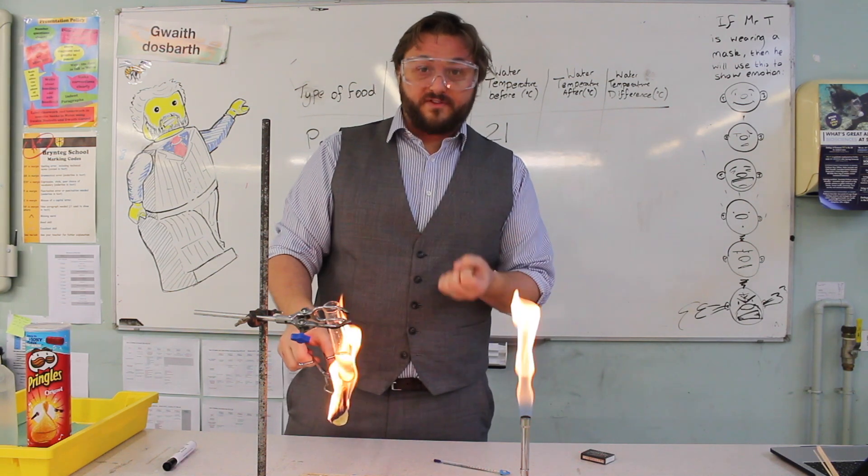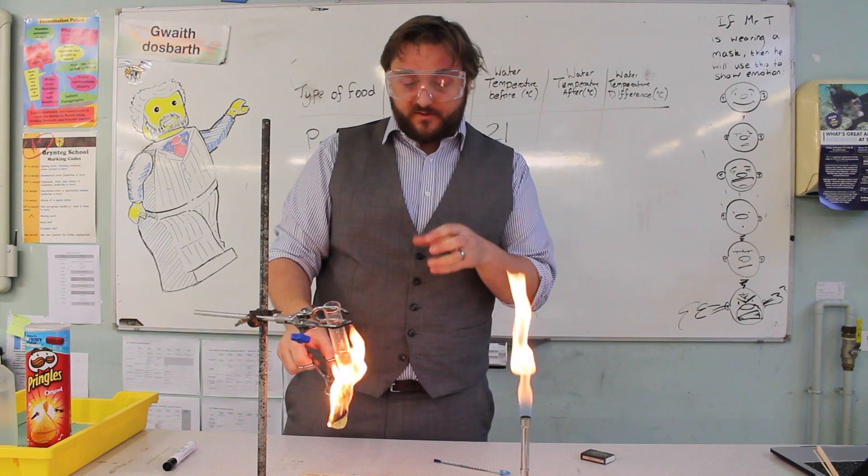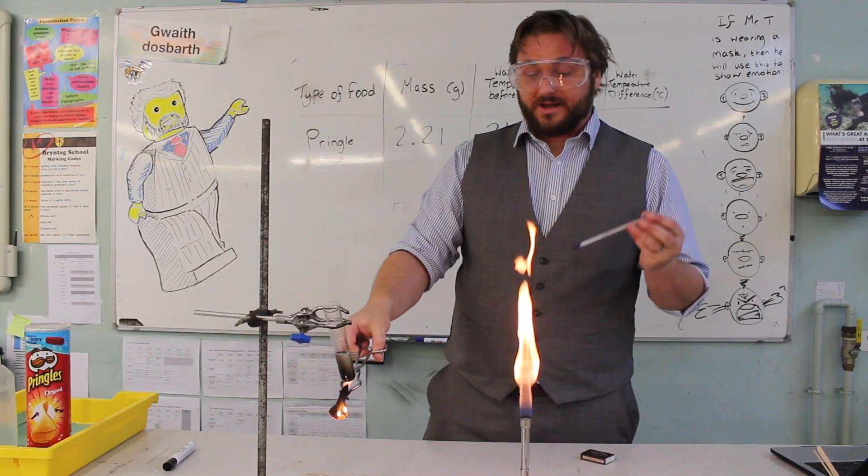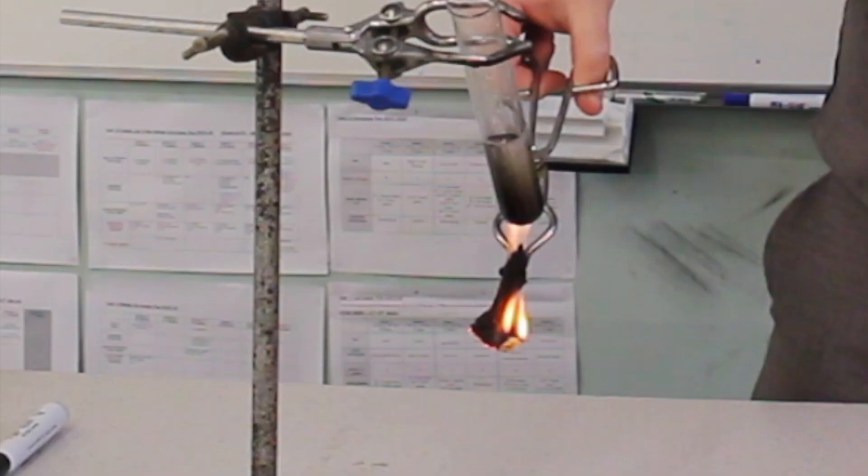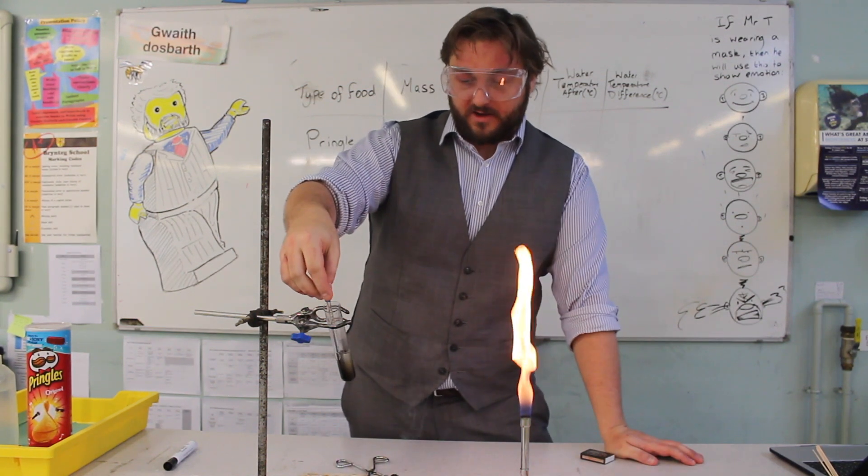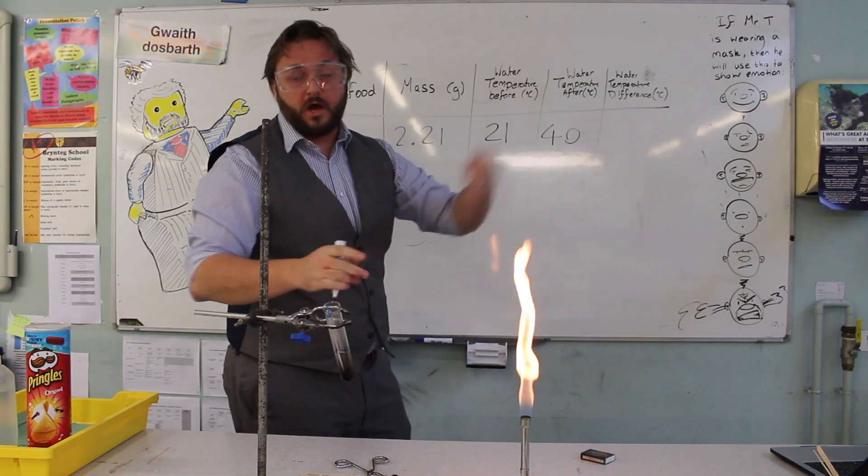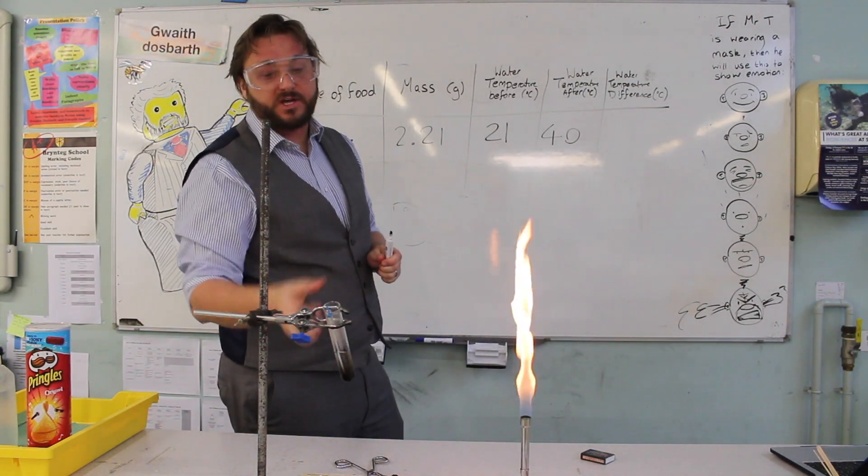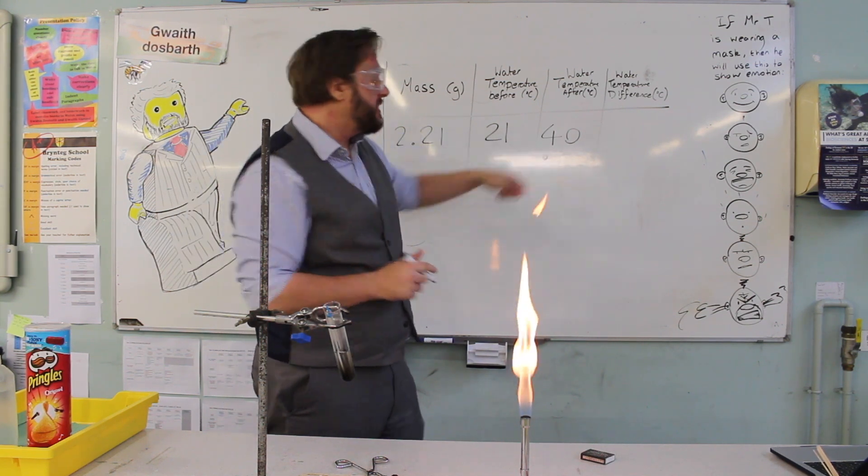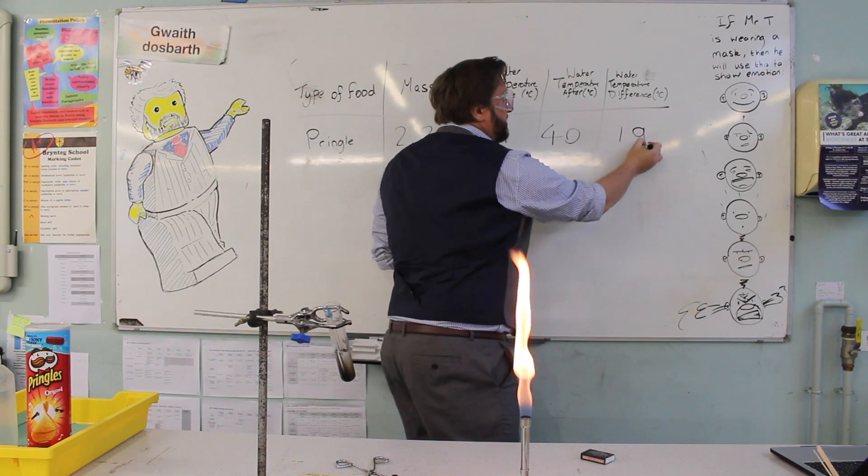As it burns, all of the chemical energy that was stored in the crisp is being released. It's being released as heat and it's being released as light. When the flame starts to die down, you want to get your thermometer ready. And once all of the flames are out, you want to immediately carefully measure the temperature of the water. So the water has heated up because it's gotten all the heat energy from that burning crisp. It's gone up from 21 to 40 degrees centigrade, which means it's increased by about 19 degrees centigrade.